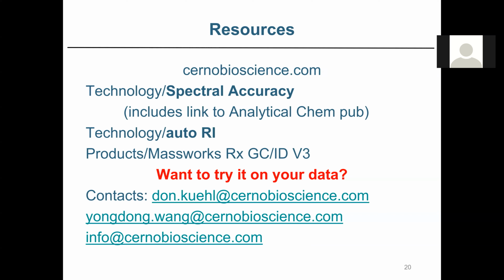And the modern instruments are so darn stable. There's actually published work showing that the spectral calibration is good for many days. So at most once a day is all you need.